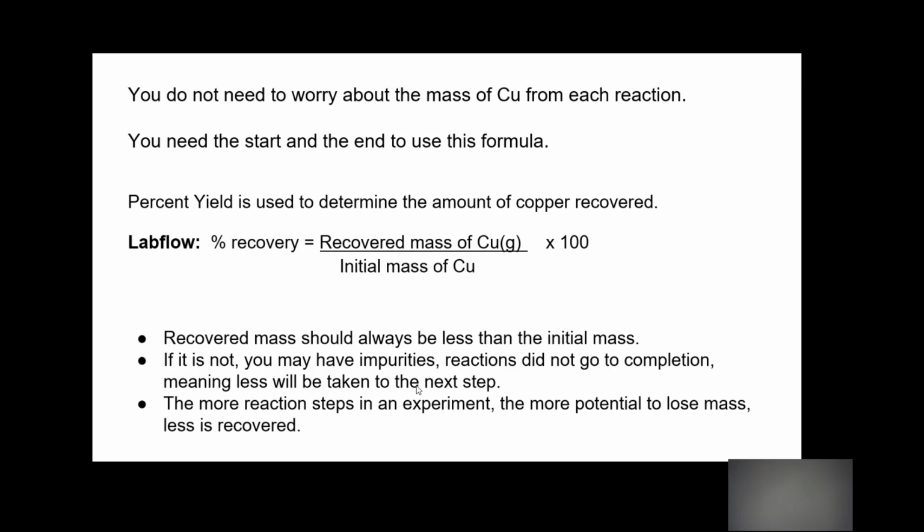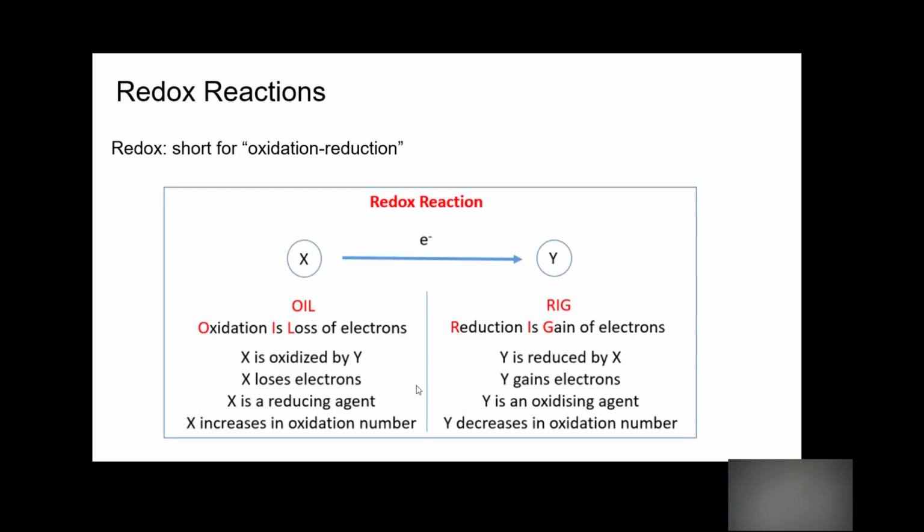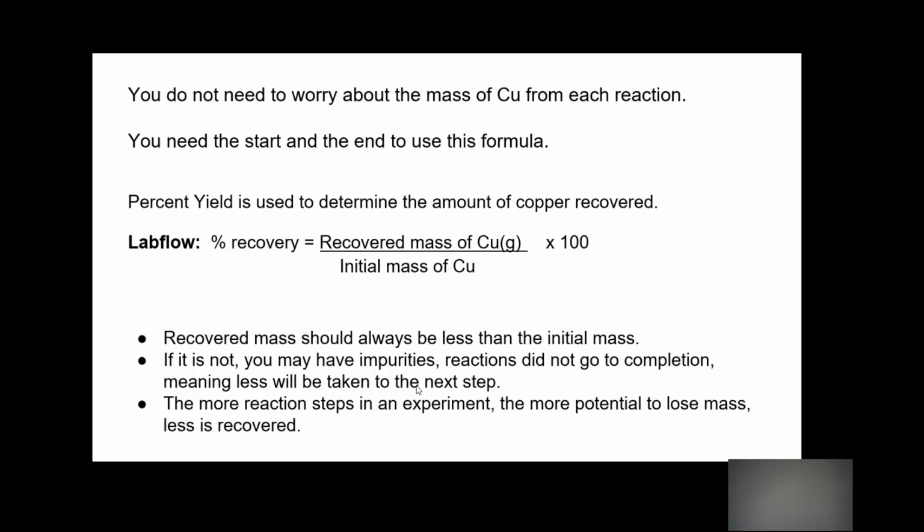So the only thing I can stress, because it's not set up that way, is to study the reactions as much as you can. Try to understand as best you can, and I pulled up some slides to help you with that. When we look at these reactions, we're not worried about the mass of copper in between, because in some of these we really couldn't tell, since it's in aqueous solutions. They're not even in a solid form, so we wouldn't be able to get that information. So we start with the beginning and the end.